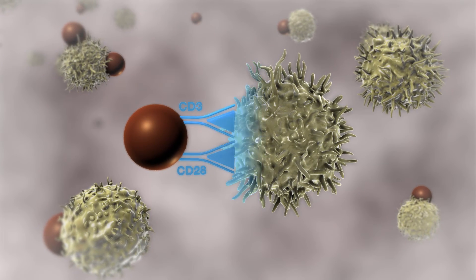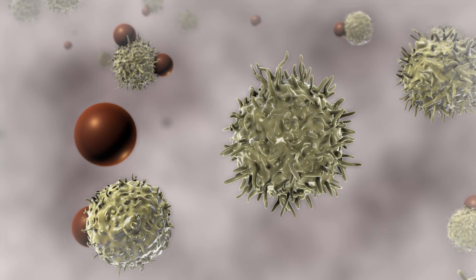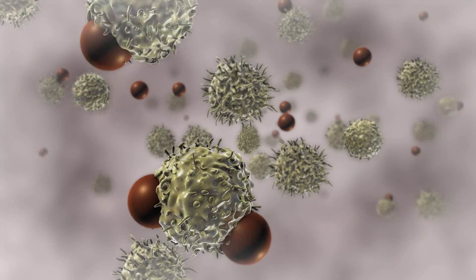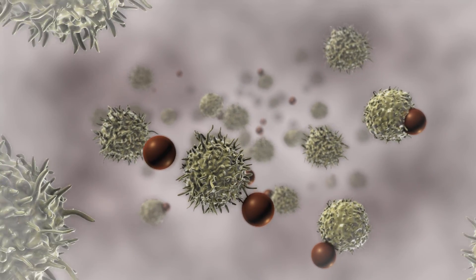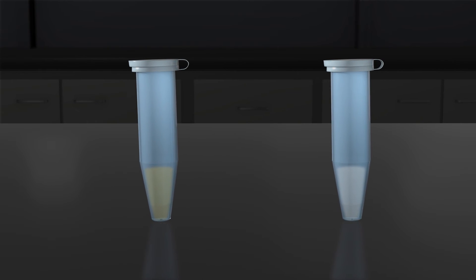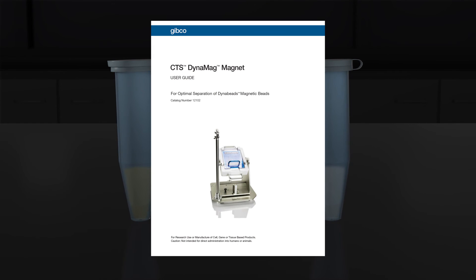Activated T cells will undergo clonal expansion to yield large amounts of cells and will naturally detach from the CTS DynaBeads CD3, CD28 beads within 4 to 5 days. The beads can be removed efficiently with the CTS DynaMag magnet after these days in culture. Compare samples using flow cytometry to determine CD3 cell isolation efficiency. Please refer to the user guide for detailed instructions.